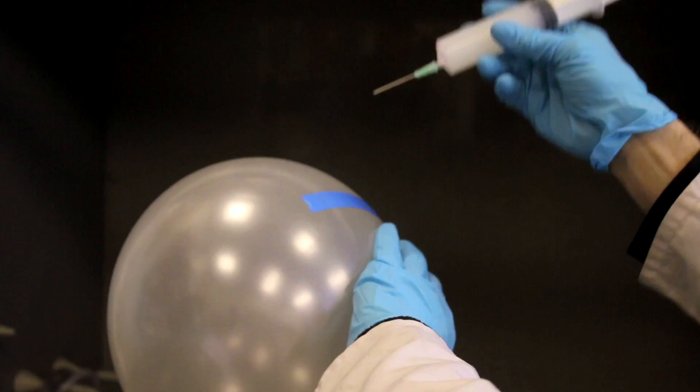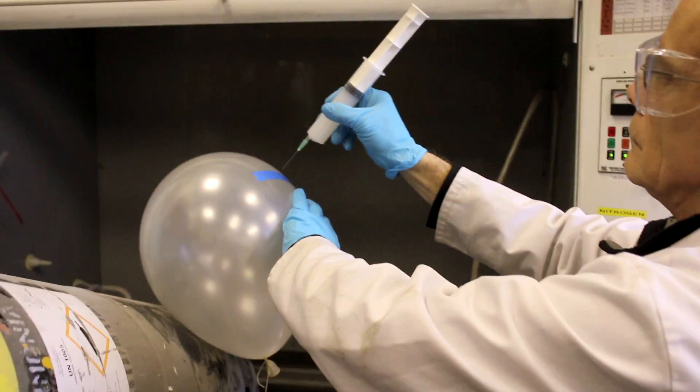But then when we started filming, the first balloon, the needle went in, there was an almost bang. We all ran out of the room because of the smell of ammonia. The ammonia disperses very quickly, so it's not dangerous.